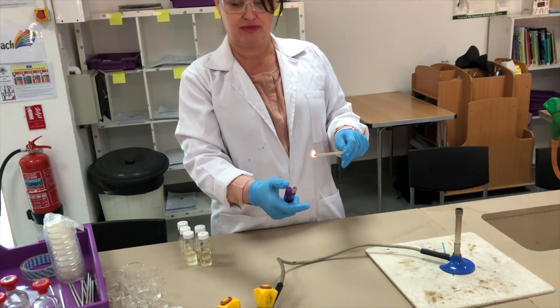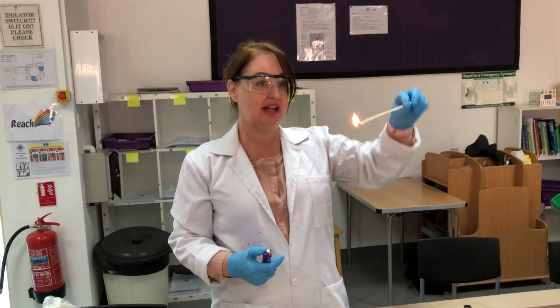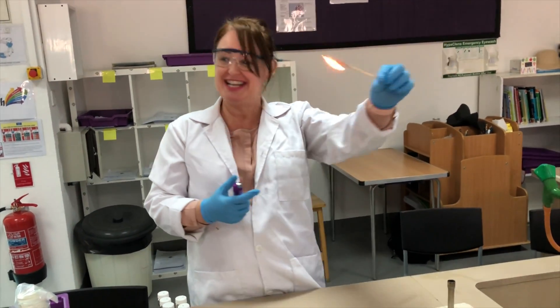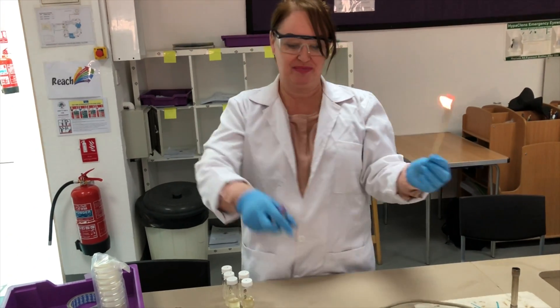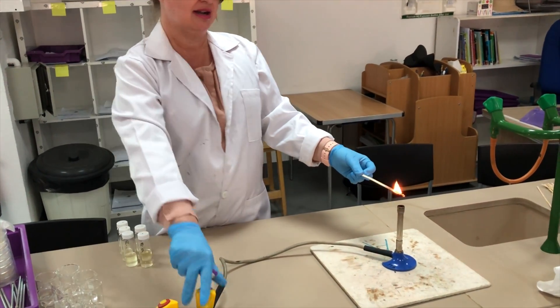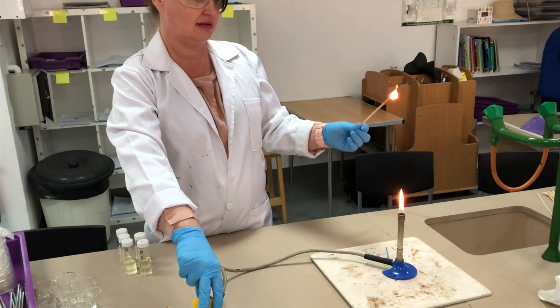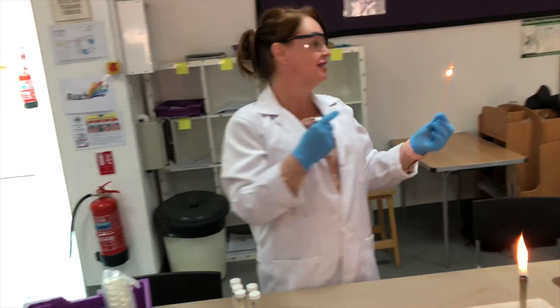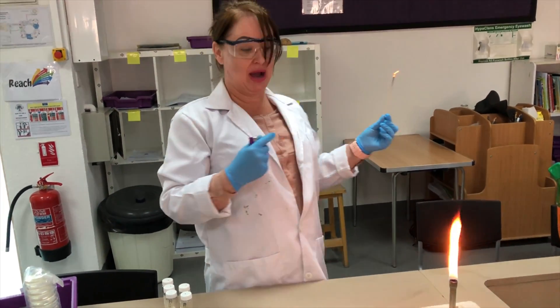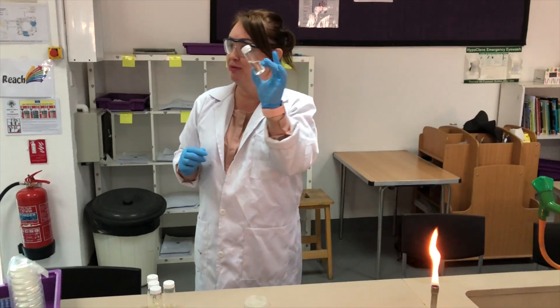When you hold your splint upright it slows down the flame; turning it the other way gives fuel to the flame and it will burn much faster. You're in control of it, not it in control of you. Stand back, don't look over the Bunsen burner, and light it. You'll want the hole of the Bunsen burner to be closed so it has less oxygen and your flame will light on a safety flame.